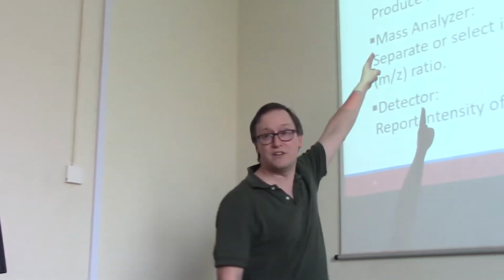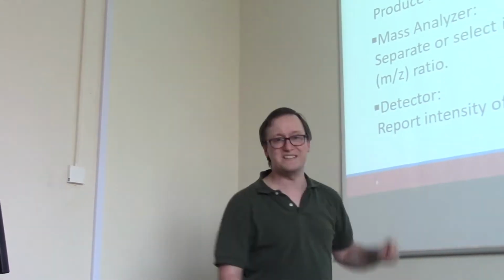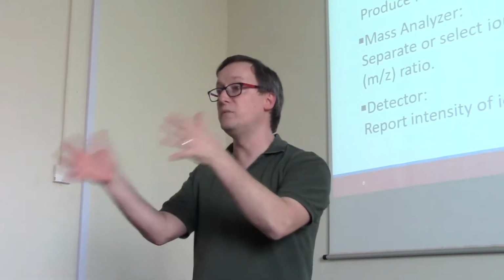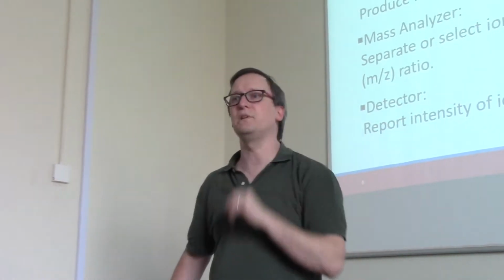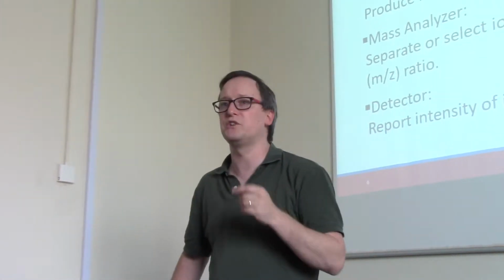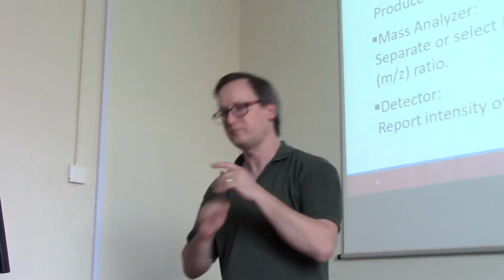So that's brilliant. We have an ion source, MALDI or electrospray. We have a mass analyzer that allows us to manipulate the ions by their mass to charge ratios. And finally, we have a detector. One of the simplest kinds to understand is an electron multiplier or a conversion dynode. I've seen that term used also.